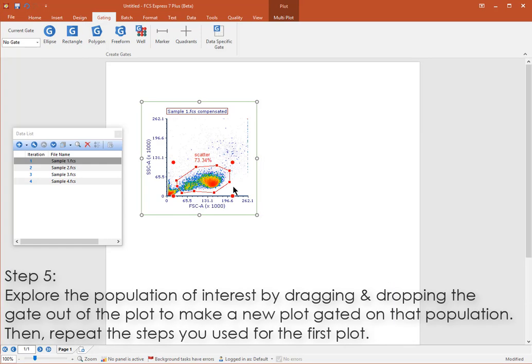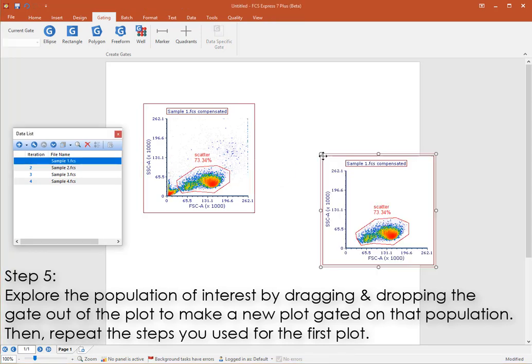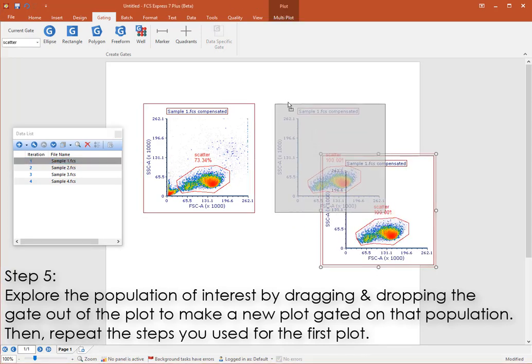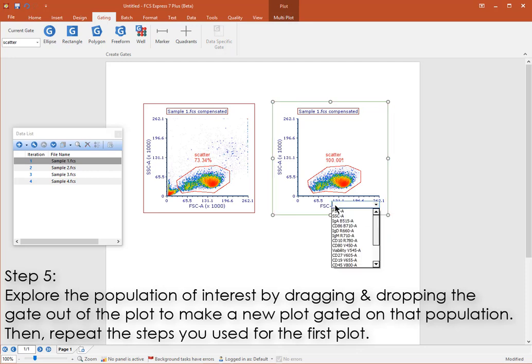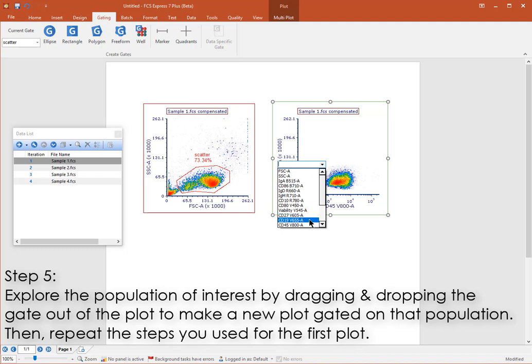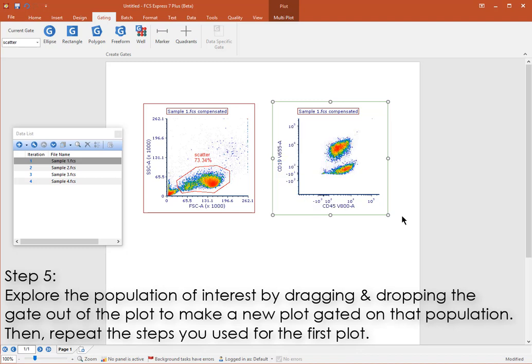Next, you'll probably want to drill down on this and other populations. Drag and drop the gate out of the plot to open a new plot displaying this gated population. Then, change the new plot's axis to new parameters, and draw a new gate on the second plot.